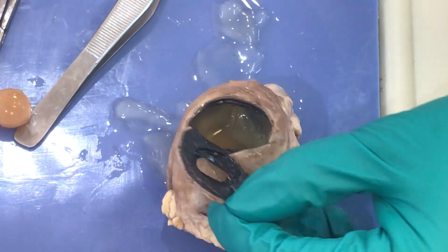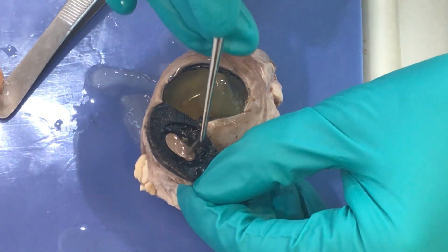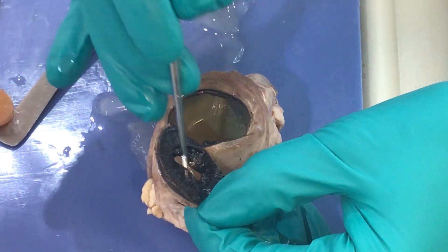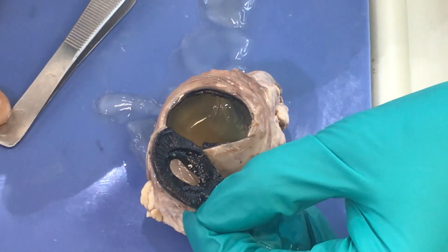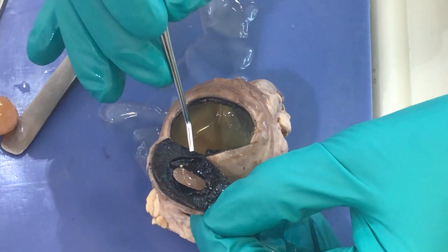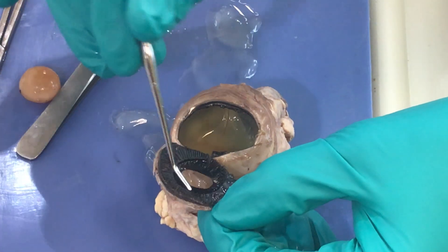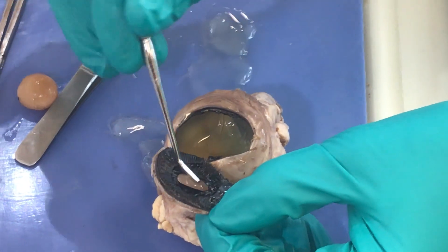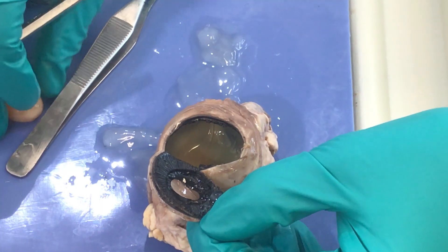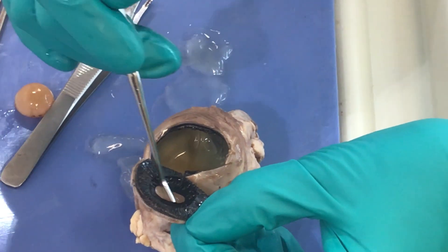We're looking through the eye as the cow would be looking. This open space is called the pupil. This thin muscle here is the iris — it's actually two muscles. We have our ciliary muscle, which is part of the ciliary apparatus, and those little fibers were holding the lens in place. The space in front of the iris is called the anterior chamber of the anterior cavity. The space posterior to the iris but anterior to the lens is called the posterior chamber of the anterior cavity.